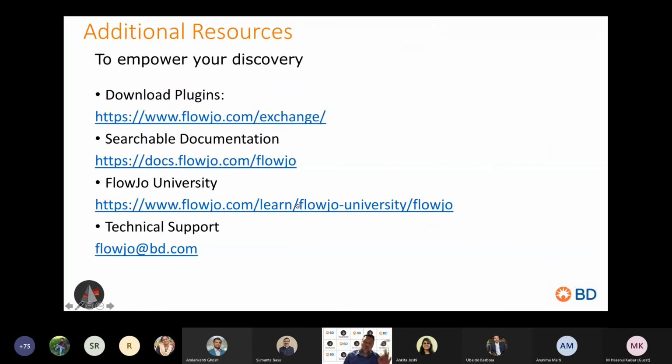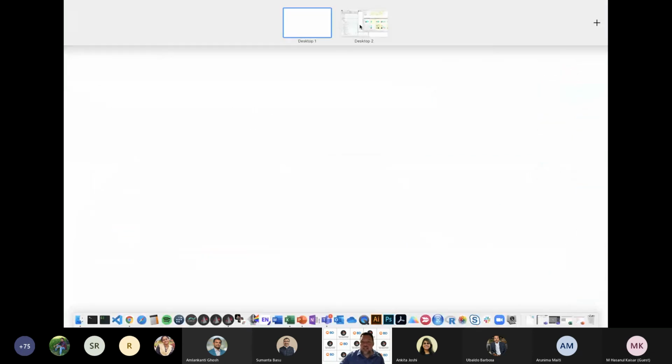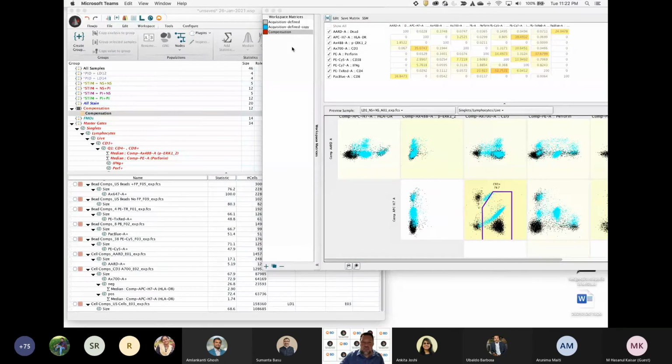And so this is a new tool that has been out for only about 8 months, since last summer. I encourage everybody to try AutoSpill just by checking the radio button there in the user interface and calculating a compensation that is not using positive and negative gates.